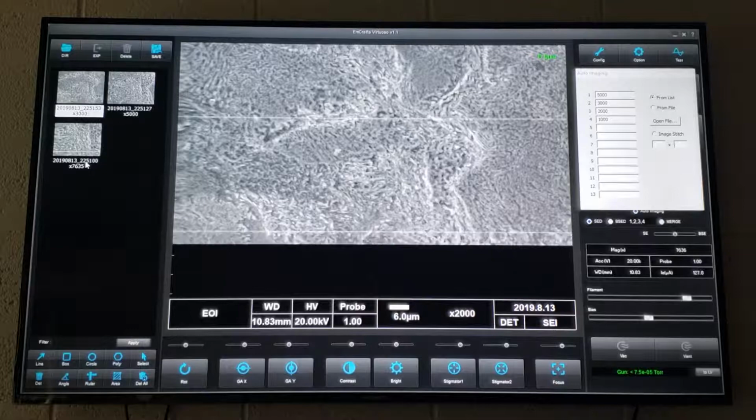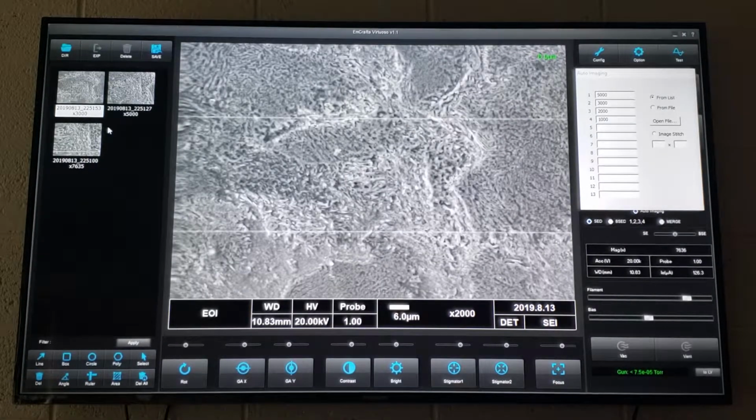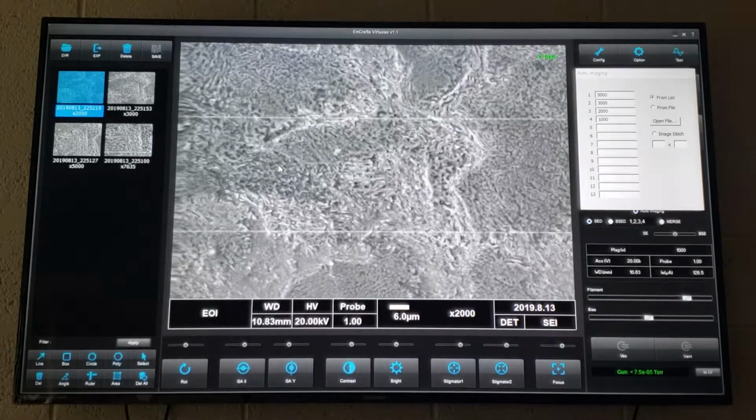And we can set that directory too, Jim? No, this is the base, this is the SCM base. All right, so you can cut and paste stuff out to wherever you want it to be. Yes, that's what we're going to do. So in here, as soon as this finishes, I'll have an option, like, if I highlight this image and I say I want to export that guy out, you can export it out as well. Yeah, because we usually set up folders by semester or section.